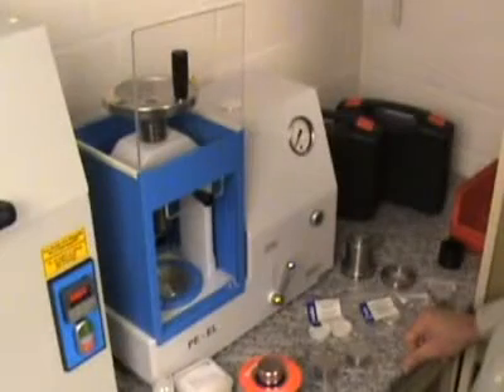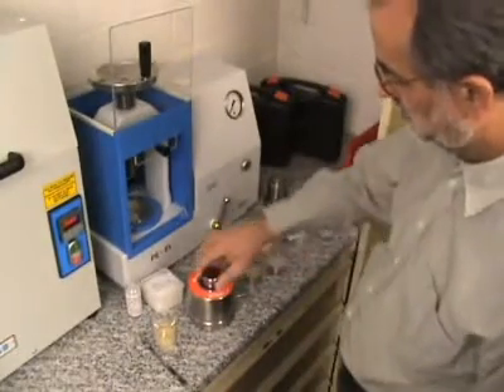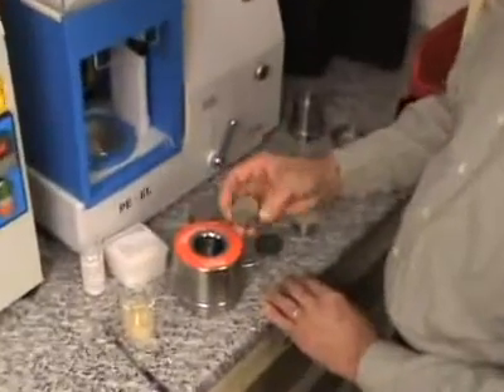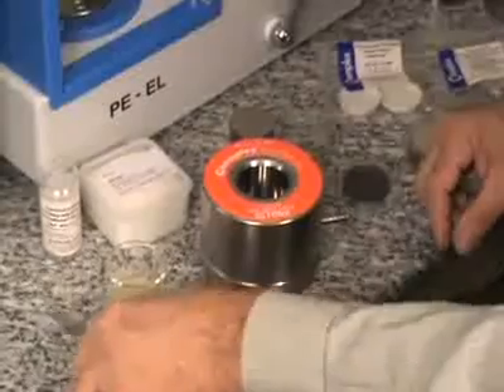Here we demonstrate the production of pressed pallets with our stainless steel die set of 40 mm diameter. A polished plate with a polished side facing upwards is inserted.